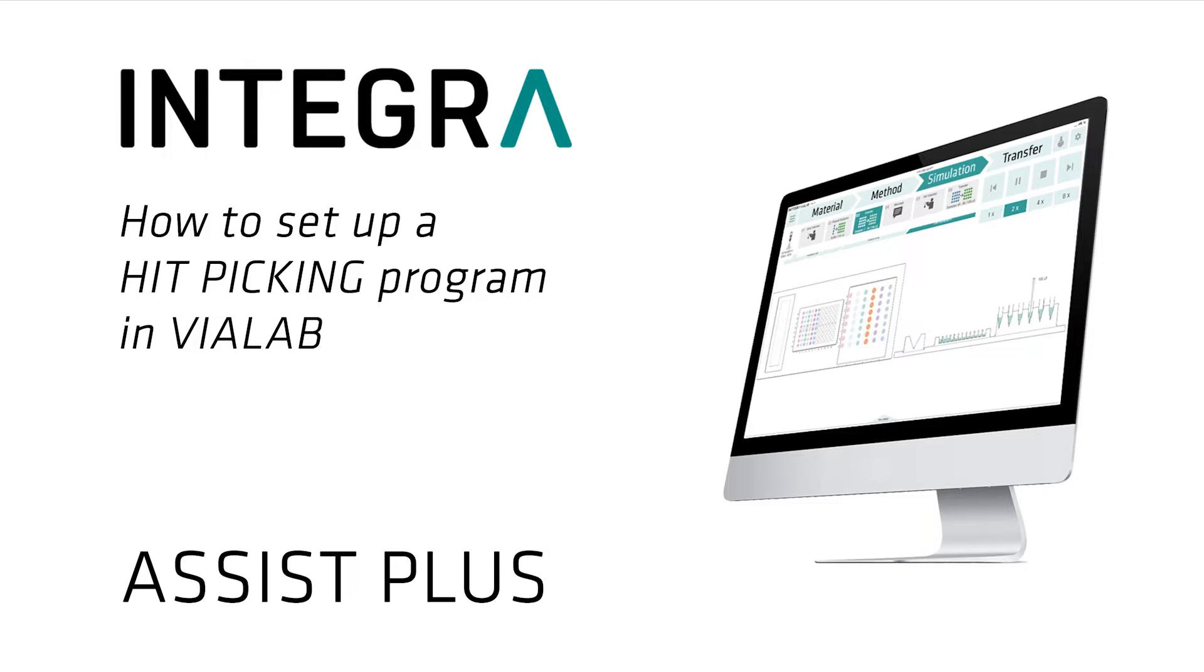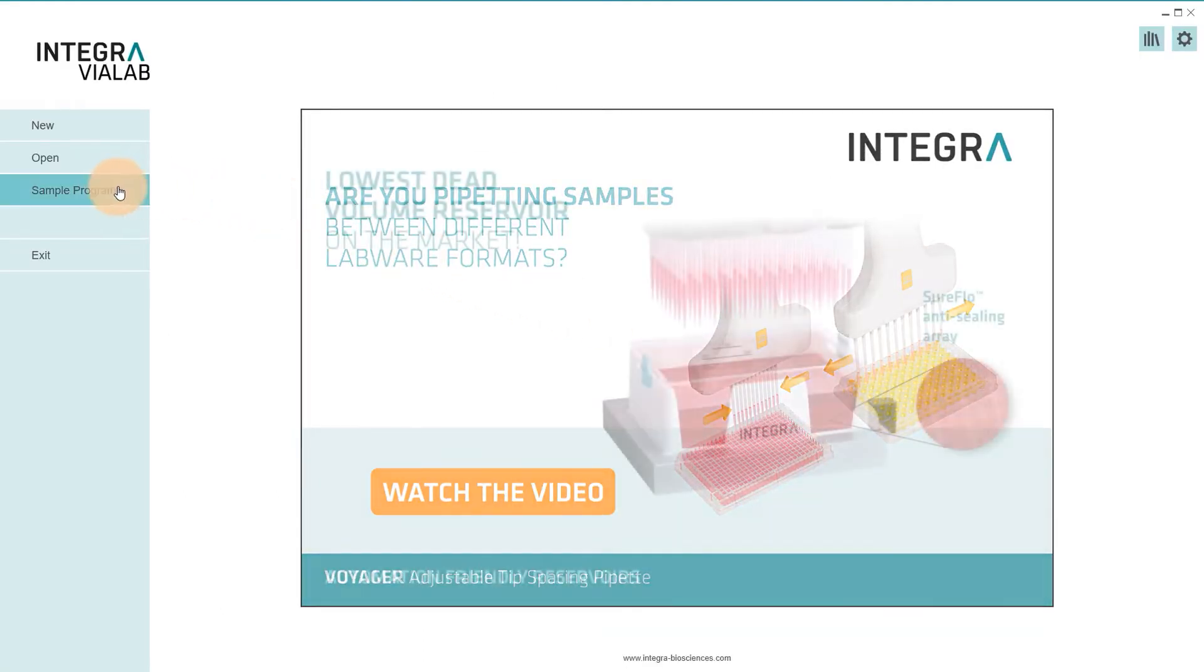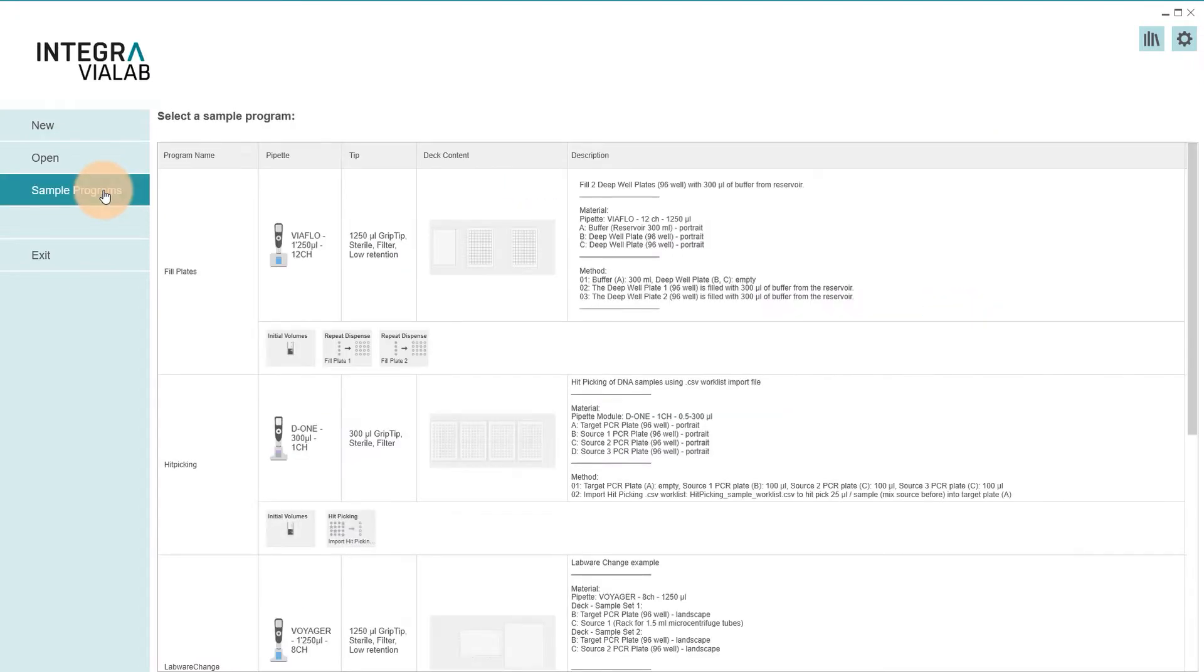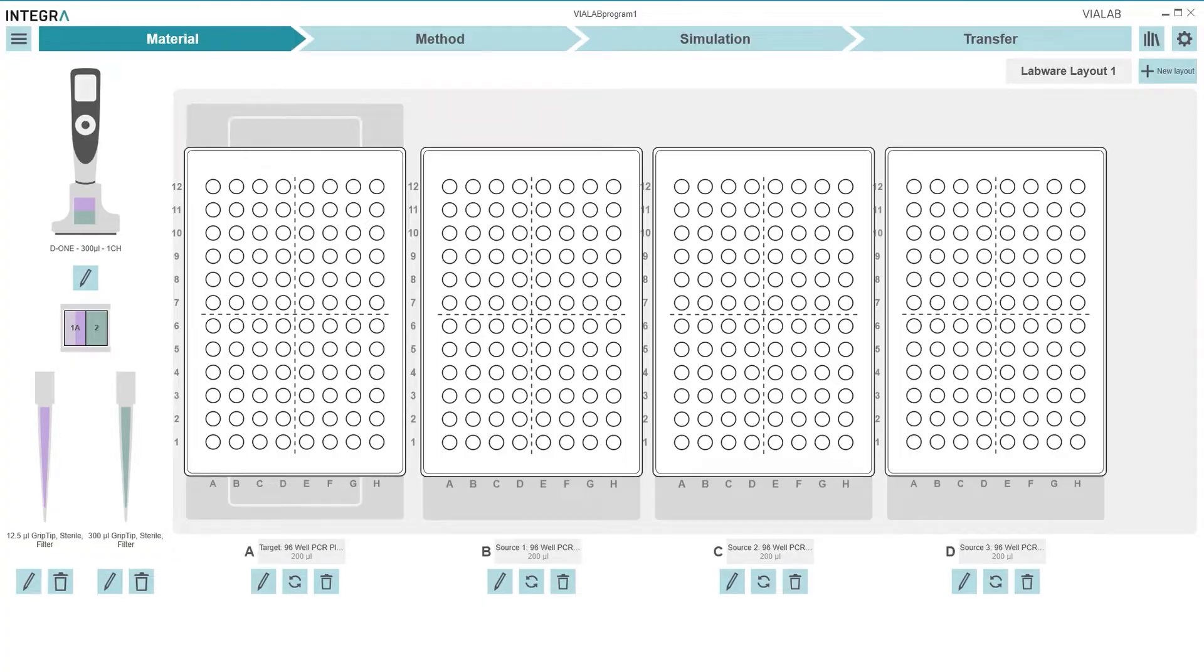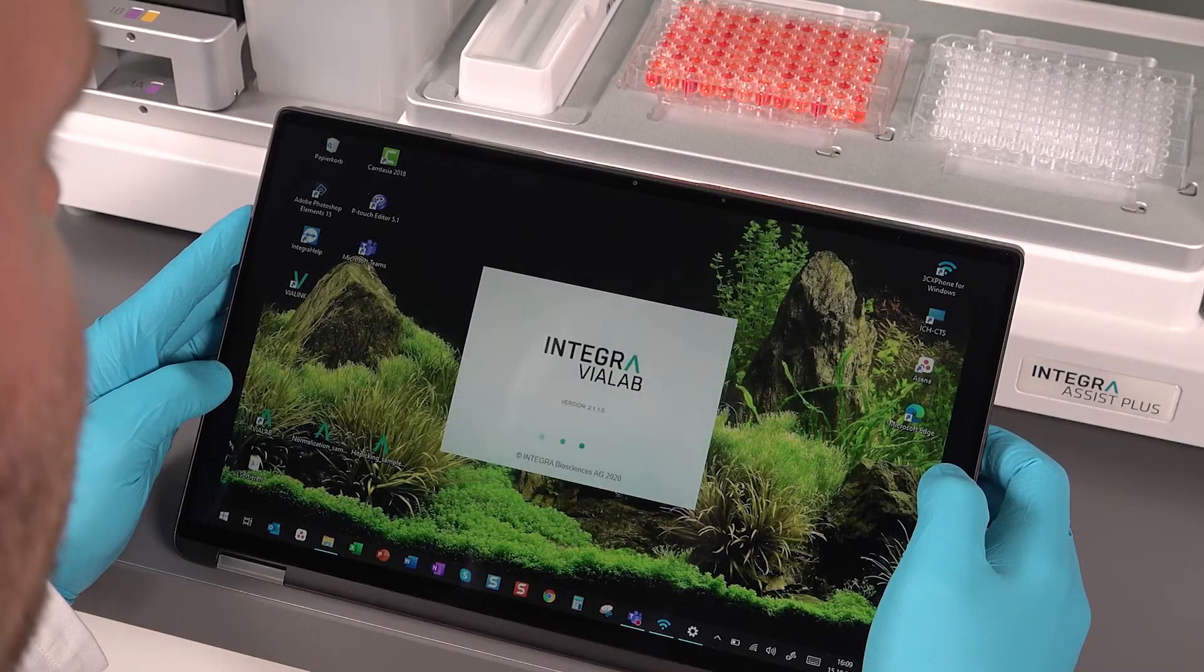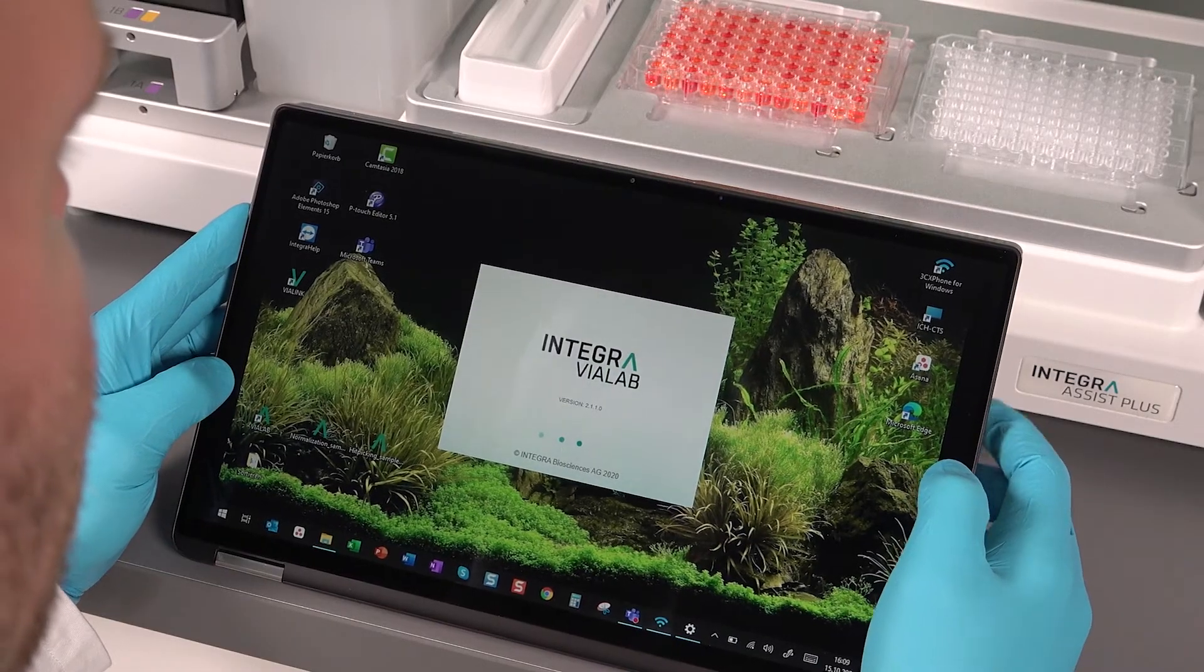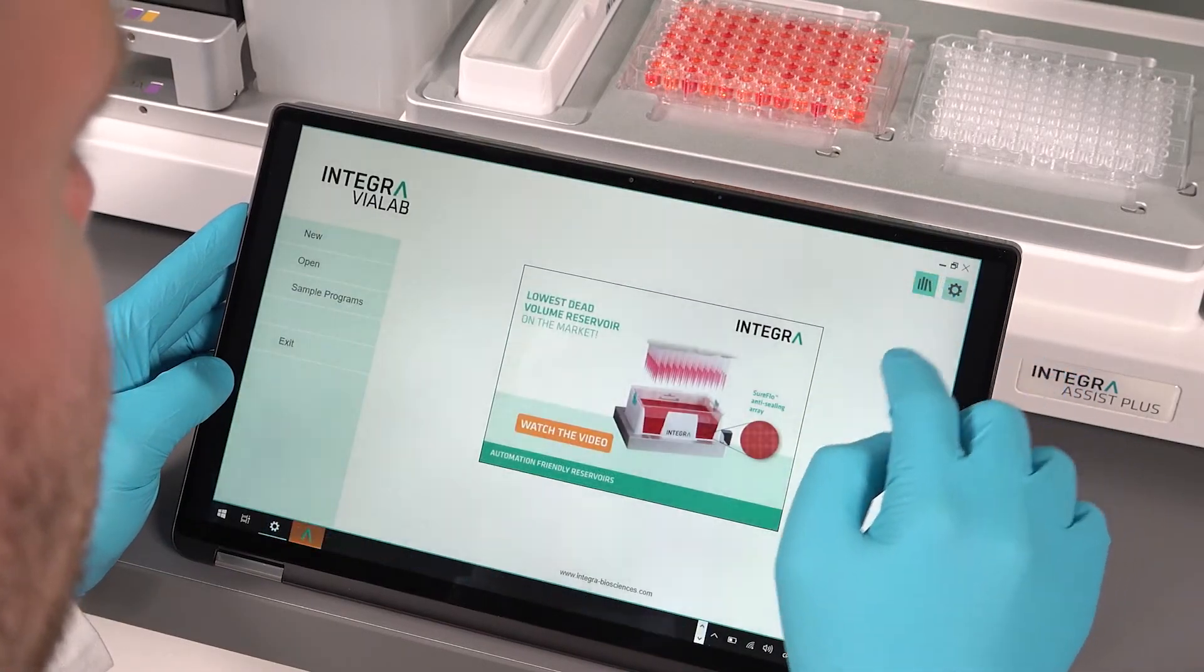To make it as easy as possible we provide a predefined hit picking sample program with a general setup to illustrate how a hit picking step can be implemented in VIALAB. So let's get started with our step-by-step guide to creating a hit picking program in VIALAB.